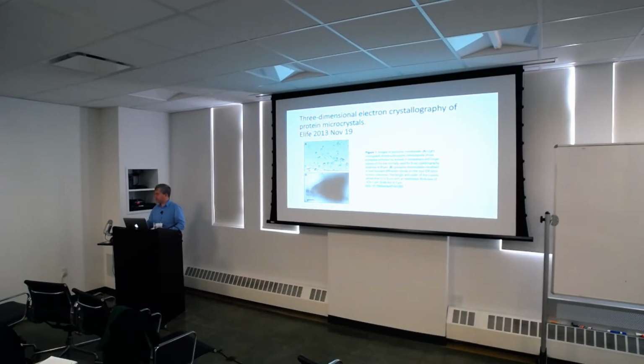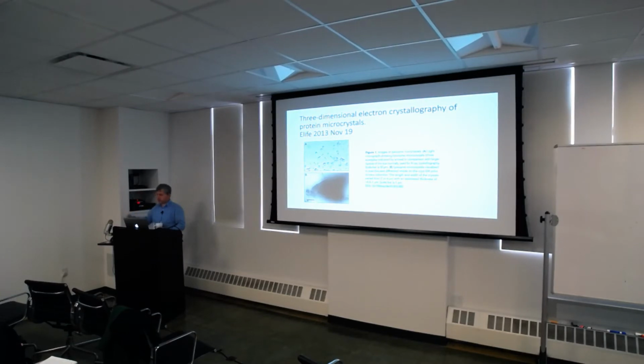I think with X-ray it can be a problem that you can oversaturate your detector sometimes. With this, I think they said it's never been a problem because you're getting a low enough signal that it's always within the linear range of the dynamics of the detector that they're using.